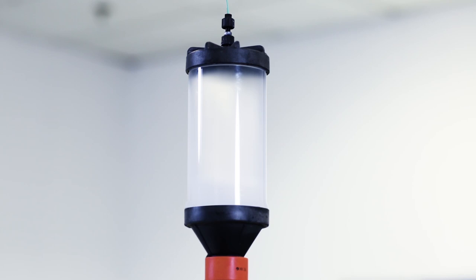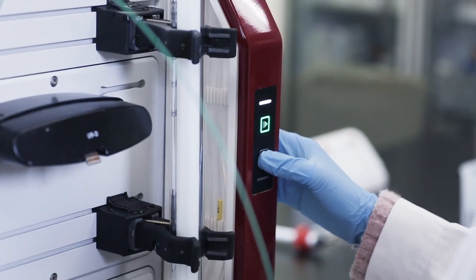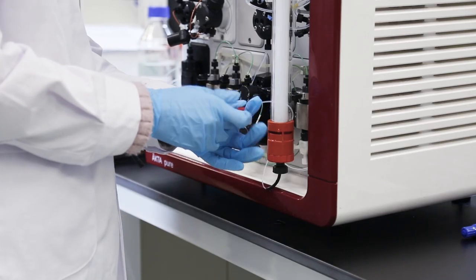When the bed height is stable, mark the level of the resin bed. Stop the pump and place the stop plug at the bottom of the column. Remove the column from the stand.